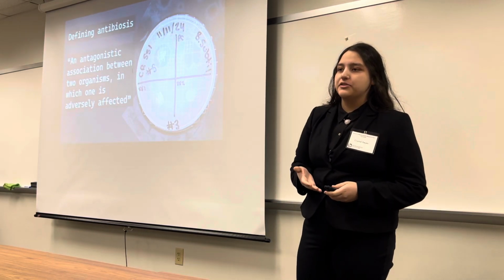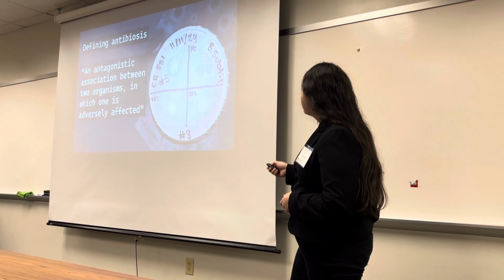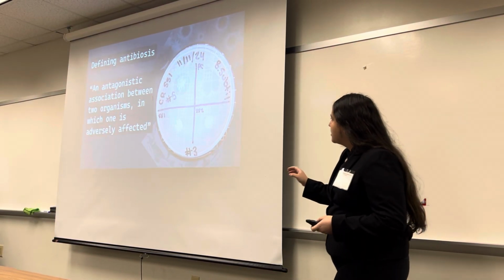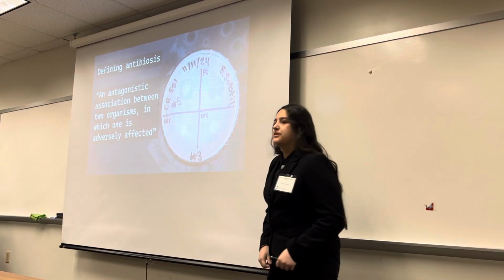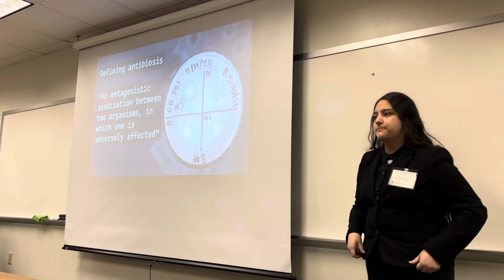So to put that in a visual sense, this is a sign of antibiosis. You can see in this media plate right here, there are all these dots around and some are touching. However, the one in number 5 is not being touched because the bacterial colony over here is producing a substance that is pushing away all the bacteria that is taking over the media plate.